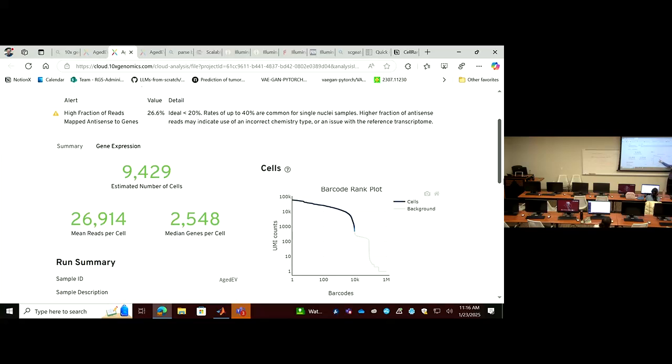But once you have enough UMI counts, those are the non-empty droplets, with cells in there. But we need to set a cutoff. This is a beautiful curve because you have a sudden drop. It basically tells you your droplets are clearly separated into two groups, empty and non-empty. If you don't have this clear knee-shaped curve, and instead have a continuously dropping, very smooth line, that's not good.